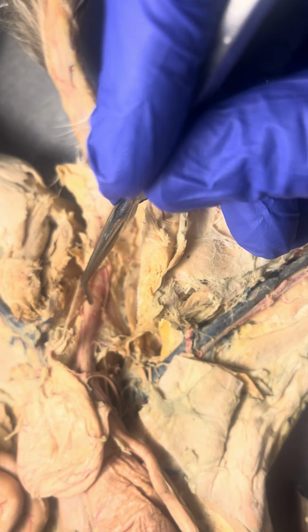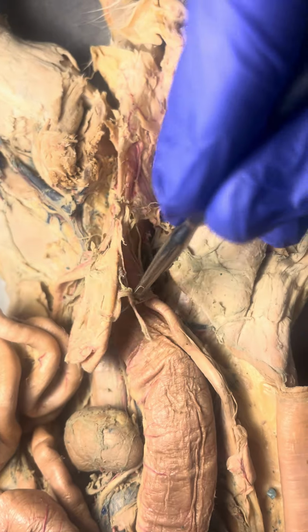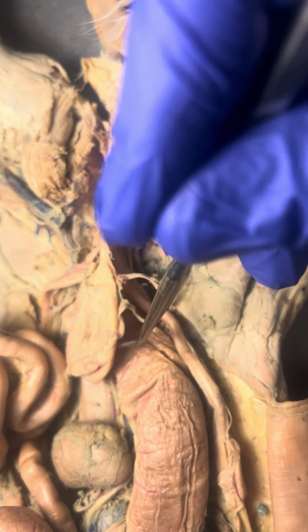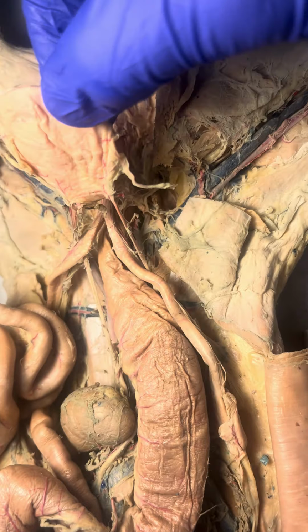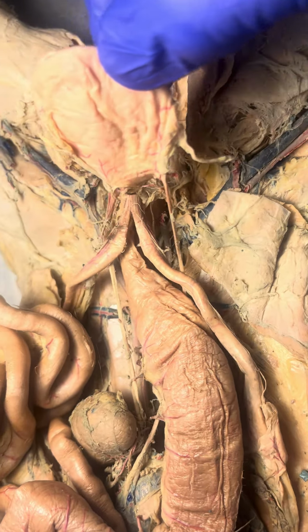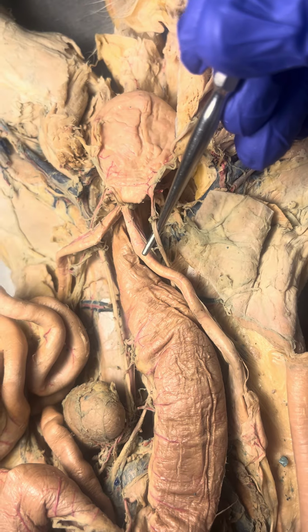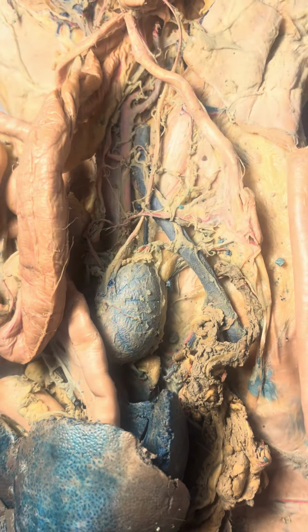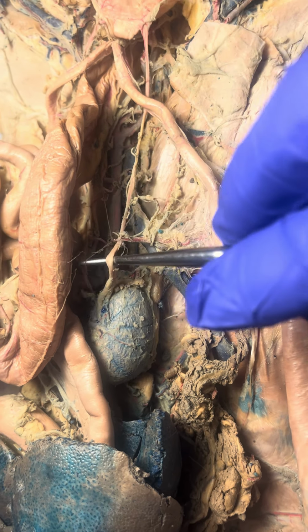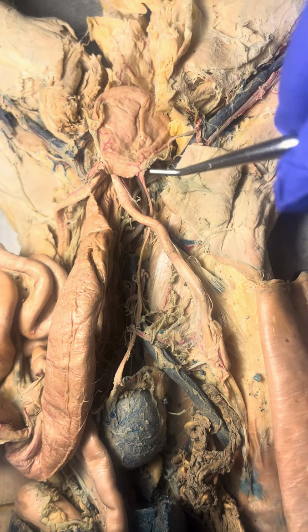So, coming to the urethra, I can follow the urethra up, and what I see is the bladder. This sac is the bladder. And then if I look at what goes into the bladder, I can see these 2 skinny tubes leading into the bladder. These here, here's one. And those are the ureters. And I can follow them up and see that they're coming from the kidney. Here it is here. Okay, so here's the ureter coming from the kidney and going down into the bladder.